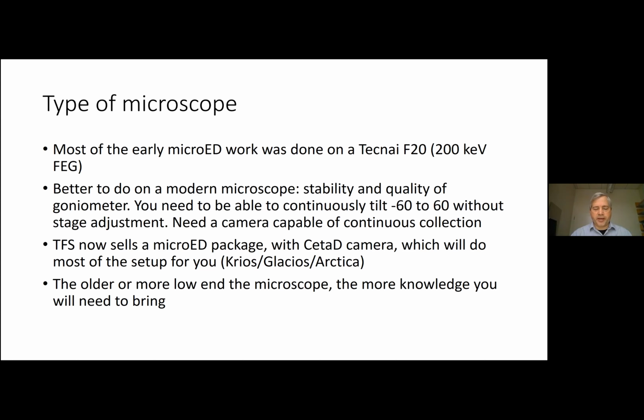Certainly, if you can use something with an autoloader type system, which is a high quality goniometer, everything's much more stable. You don't have to worry about a side entry holder. It's just going to be a lot easier. You also need a camera capable of continuous collection. I have a slide on that next.